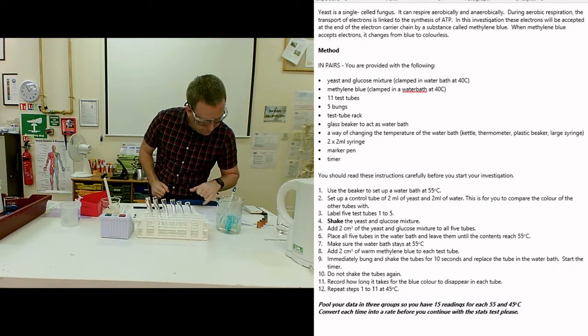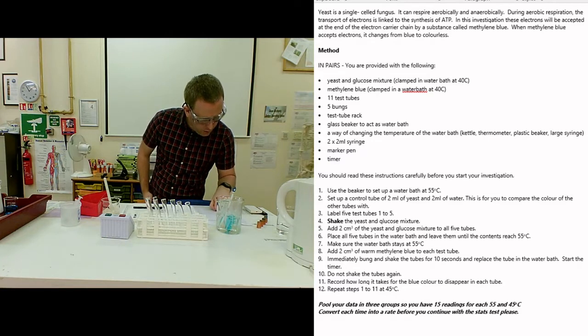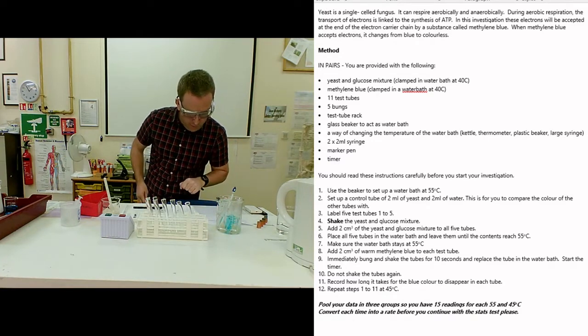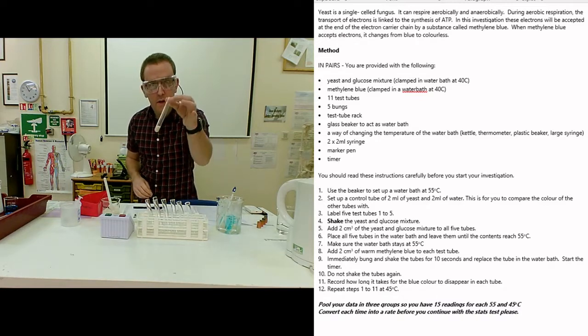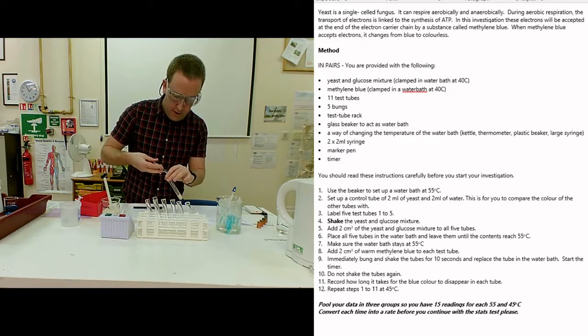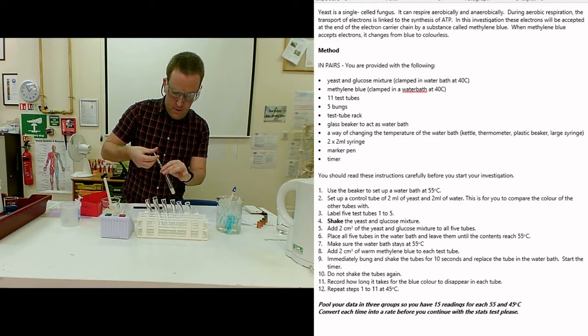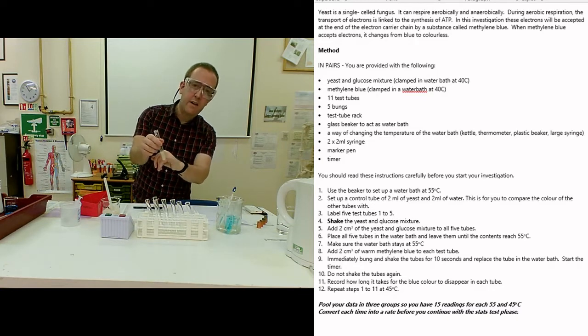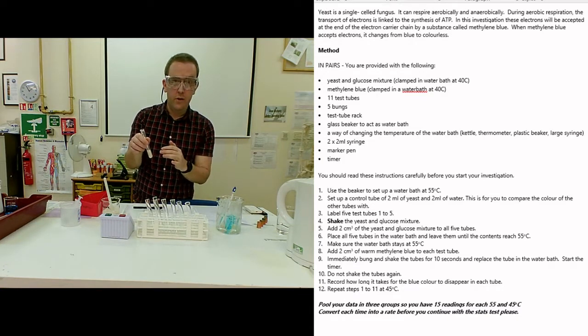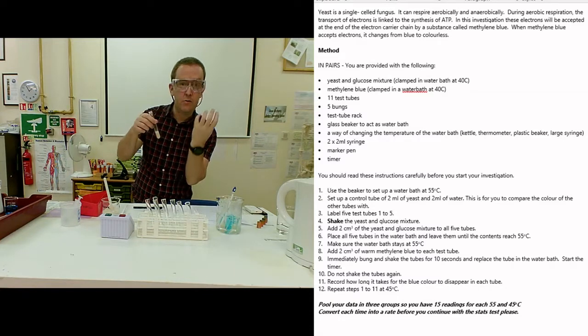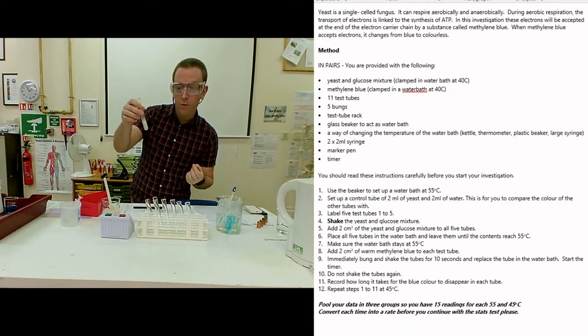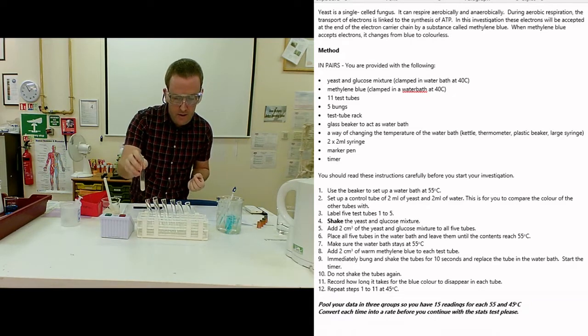Number two, set up a control tube of 2ml of yeast and 2ml of water. That's for you to compare to. There's my 2ml of yeast and here's my little syringe of 2ml of water. I'm going to put that in like that, and that's my standard for what the experiment should look like when it's finished. That's what I'm going to be comparing to, because one of the issues of this experiment is the subjective nature of it.